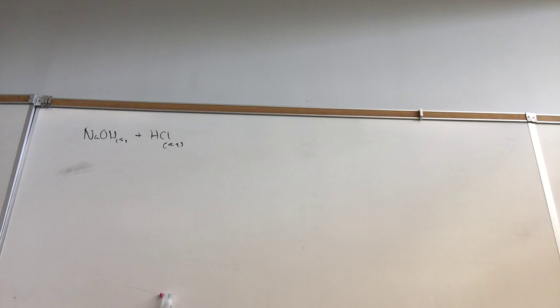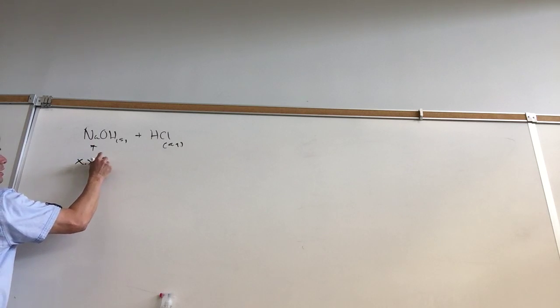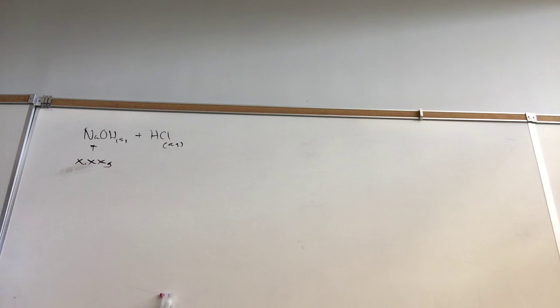Well, we wouldn't use it. And so, anyway, we're going to weigh out some sodium hydroxide. It's not going to be a lot, just x.xx grams, so around 2 grams worth. But I'll tell you, she's not going to try to get it perfectly at 2 grams. It's too hard. It's close enough. But you got to get this mass.